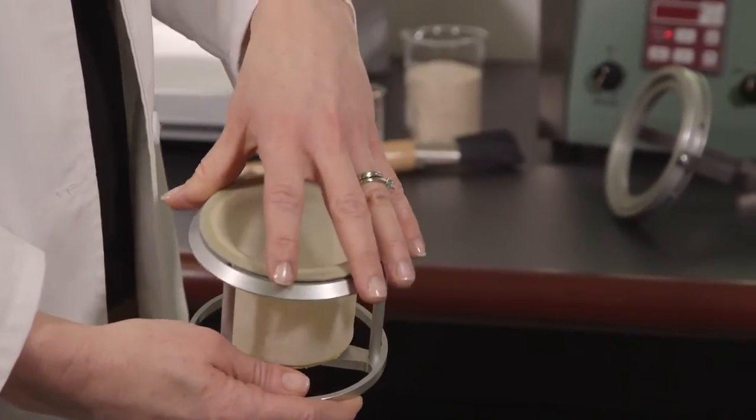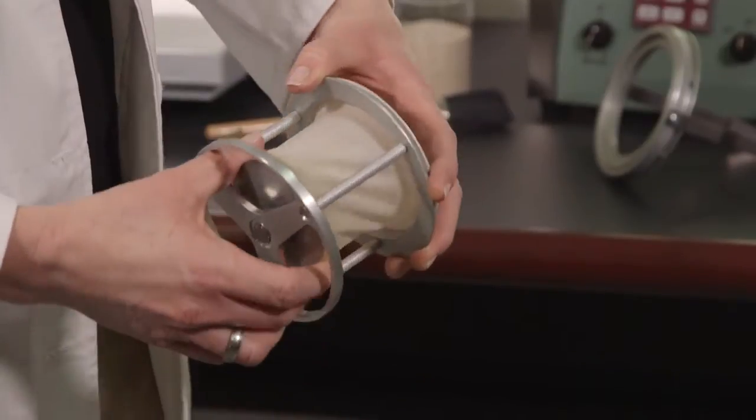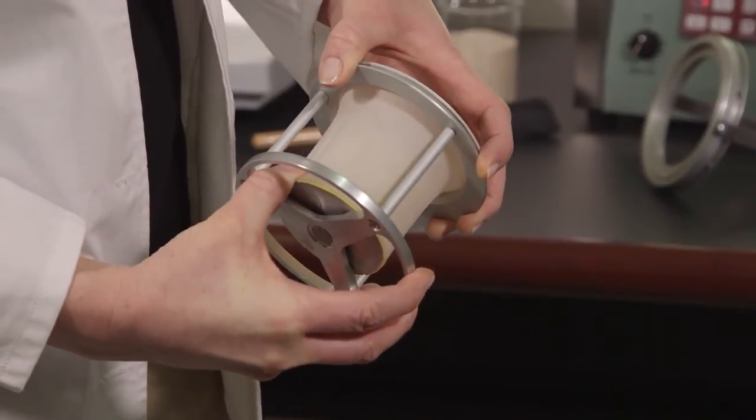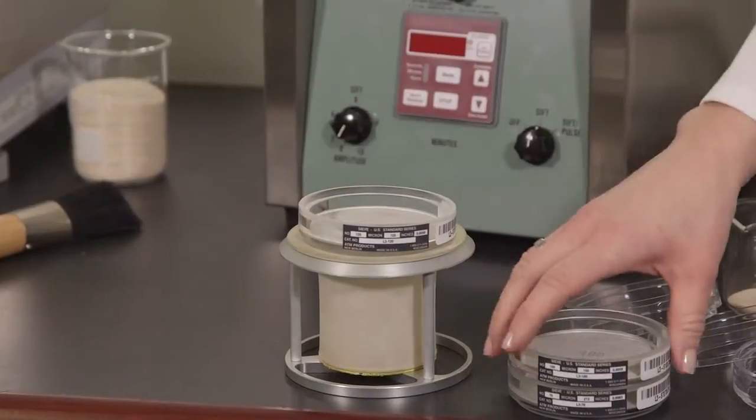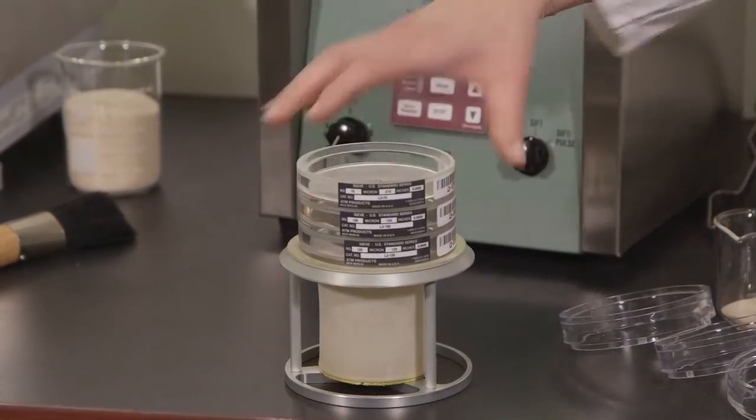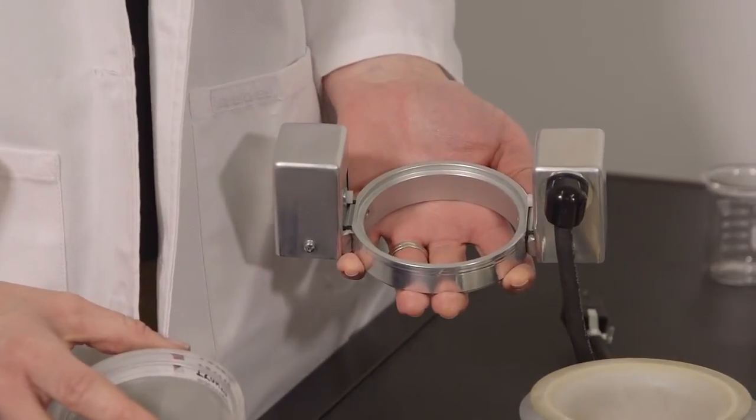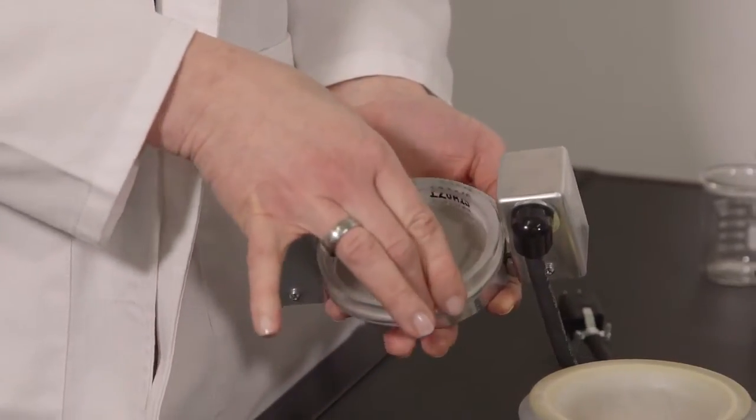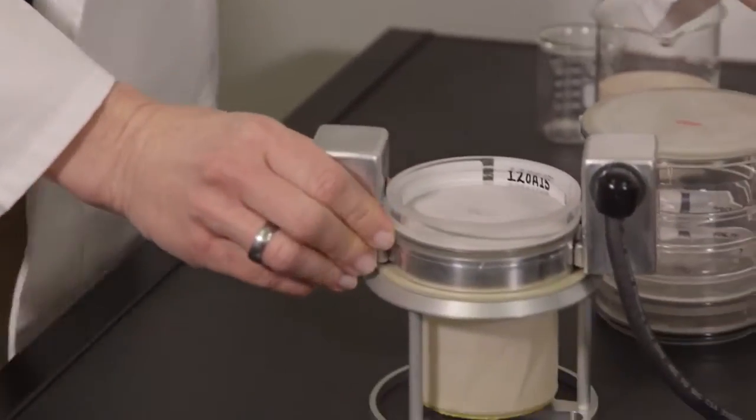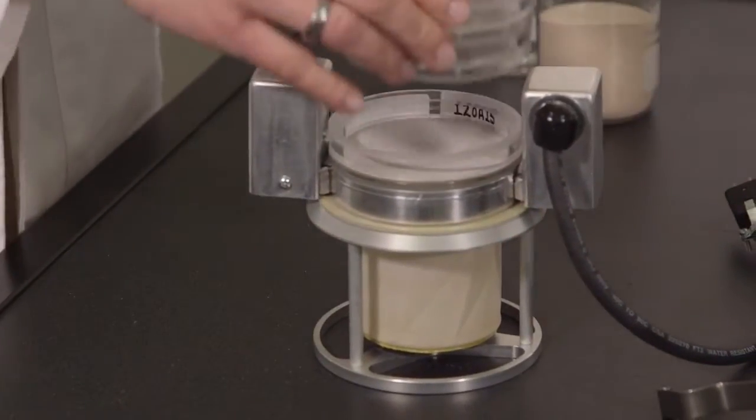Drop the fines collector into the holder and lock into place. Assemble the sieve stack with the finest sieve on the bottom, arranging coarser toward the top. When working with samples finer than 45 microns, you may find the addition of the L3N8 horizontal pulse accessory helpful in reducing agglomeration.